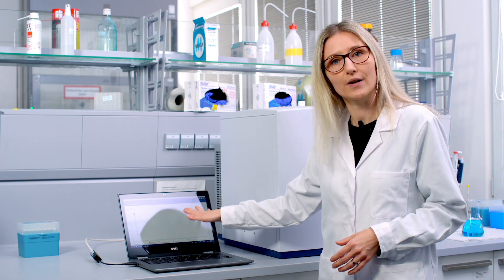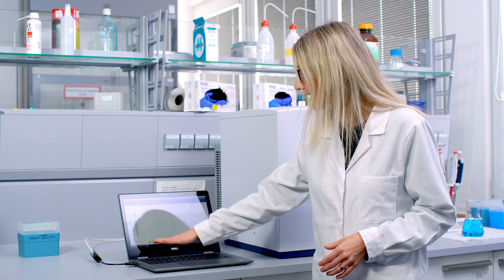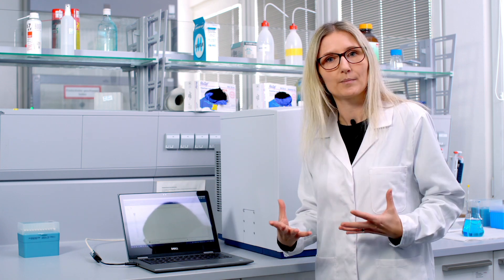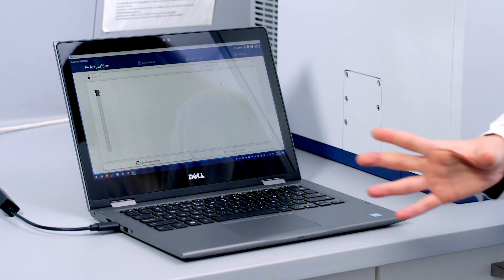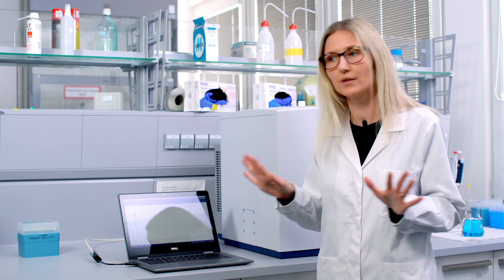You select the solvent that you have used for your sample and then you can select an experiment or several experiments based on our Bruker Pulse program experiment library. So you don't need to know anything about NMR parameters at all. If you don't need to you just run the experiments by the tap of a button.